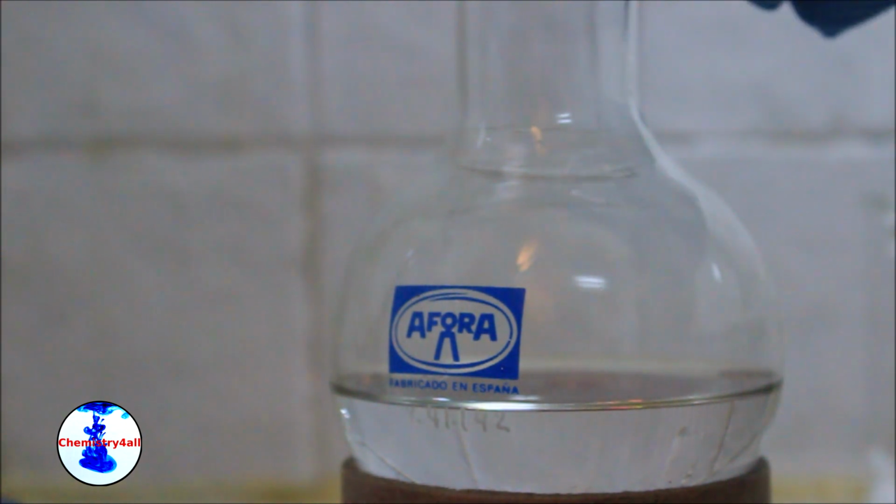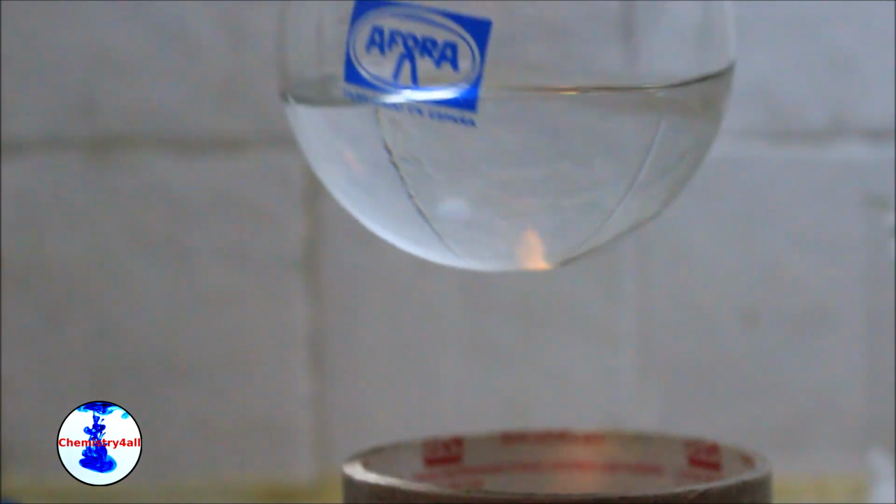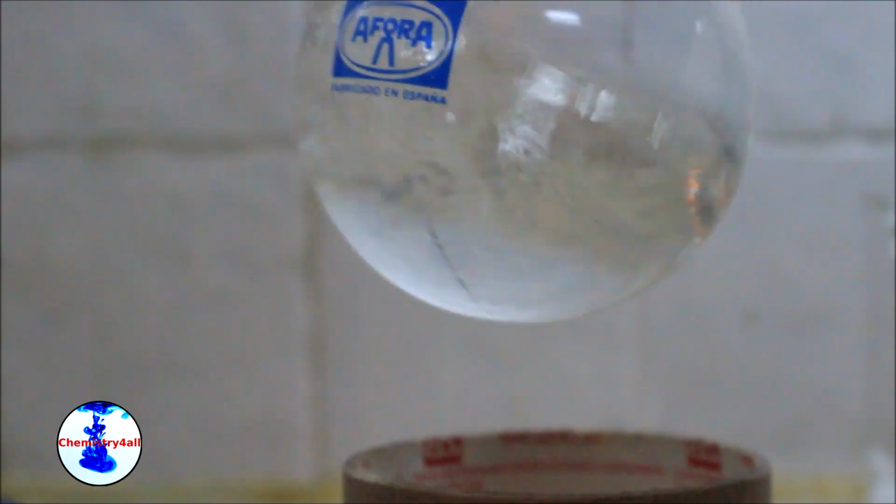Alright, so now we know that we have ethyl acetate in addition to traces of ethanol. In a future video I will try to further purify the ethyl acetate obtained by means of fractional distillation.